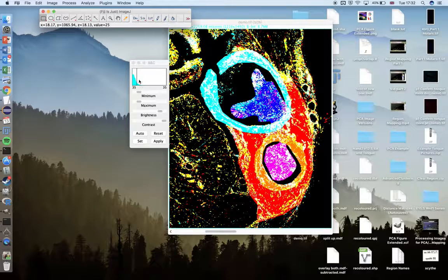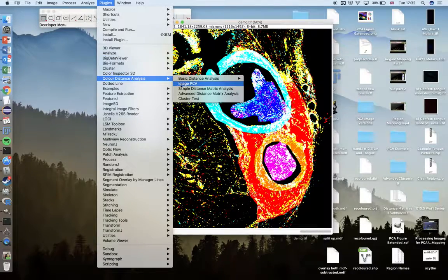So you do this for every channel. You have a final channel, which is a mask. For this, the order we have is that the mandible is region 1, molar is region 2, the incisor alveolar 3, molar alveolar 4, nothing in 5, and then incisor 6. Once you have an image set up like this, you can start the plugin.